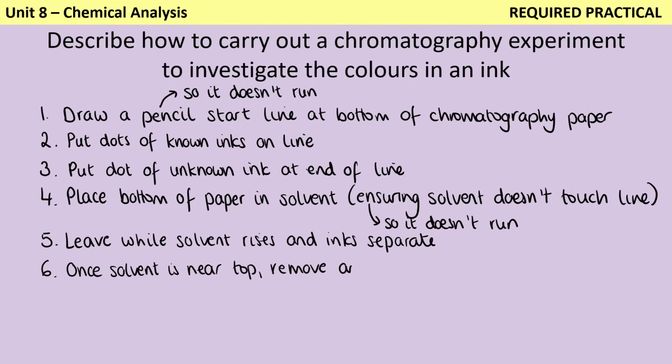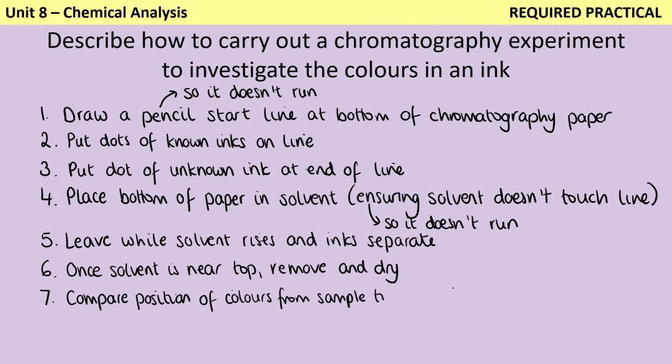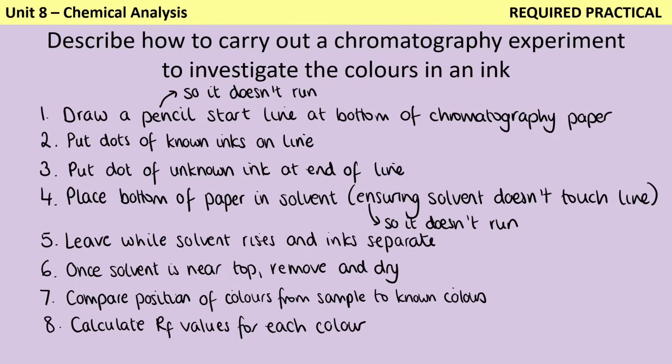And then once the solvent front reaches near the top of the paper, you're going to remove the chromatography paper from the solvent and leave it to dry. At this point, you'll be able to qualitatively compare the position of the colours from the sample to the known colours, but also quantitatively, you could calculate RF values for each colour.